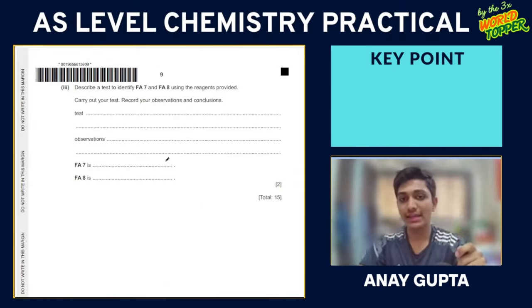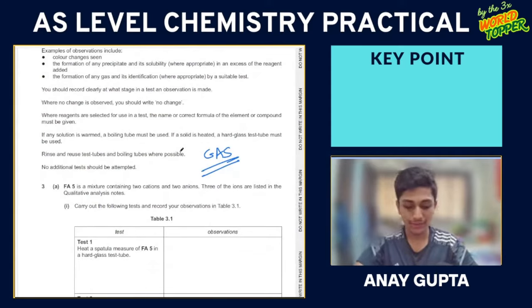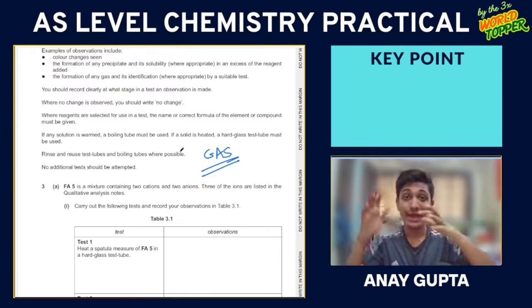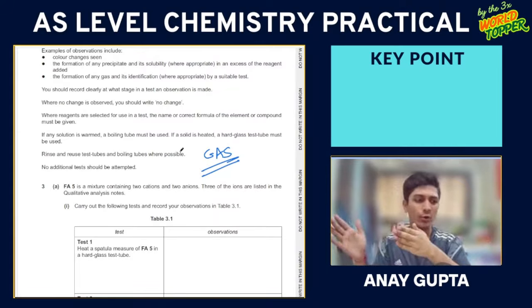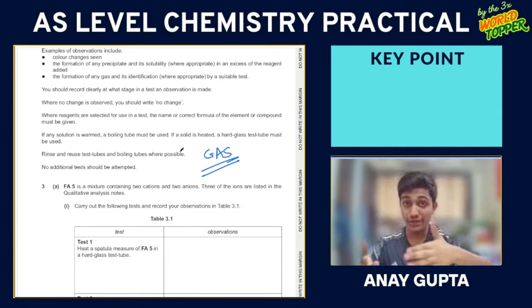Another thing is, sometimes, like what happened with me, I could see multiple color changes. Say first I saw yellow, and then it transitioned to off white with time. Another time it was bluish green, and then it became brownish with time. Whenever something like that happens, you need to specify both the colors and the order in which that happened.